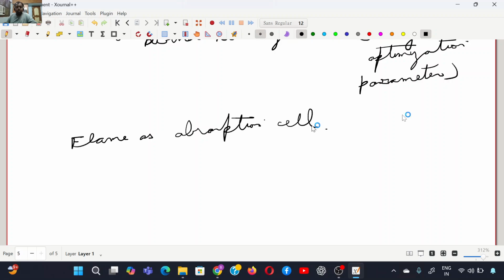That flame has a primary combustion zone, secondary combustion zone, interzonal region, and an optimal temperature for the various elements also. And the flame height adjustment, I already told you, can be done. Air acetylene flame is very common, except for the refractory elements like chromium.